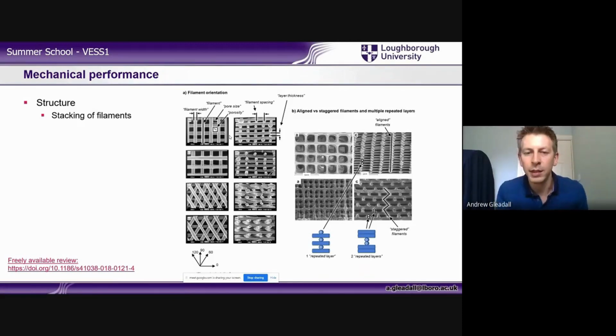It's got to be a gel, or let's say it's got to be a hydrogel polymer rather than a synthetic pure polymer. So then this is showing 4 different grid structures, like I showed you in Cura, and then the cross-sectional view of them. There's also, in this case, the grid is offset.